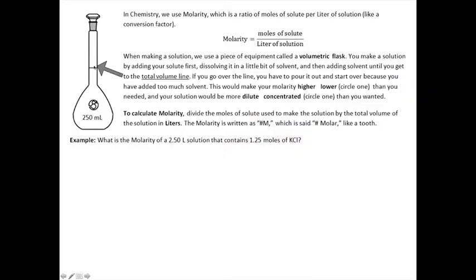So if I had gone over this total volume line right here, I would have had to pour it out and start all over because I would have added too much solvent. Think about that. Would that make the molarity higher or lower than what I needed? Circle which one of these you think would be.